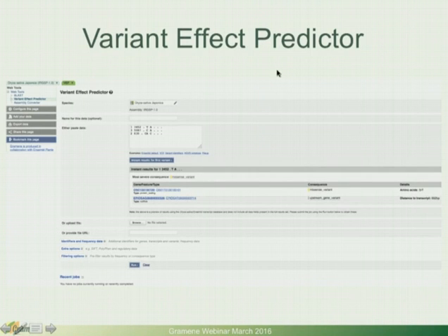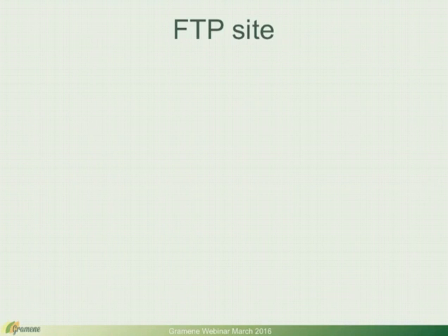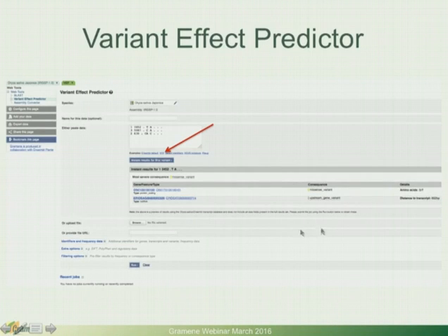You can also have your own custom data run through the Variant Effect Predictor tool, and you can see an example of the formatting that you need, which is VCF. You can click, for example, here VCF, and you get 3 entries showing the ID, the position, the alleles, and so on. Once you do that, it will predict here what consequence you can expect for your particular variants.